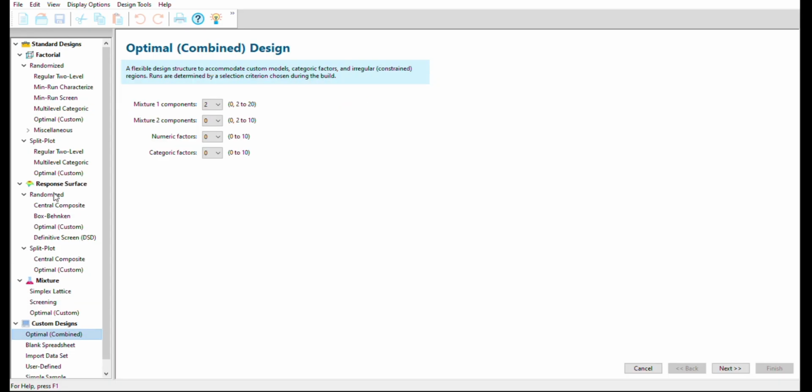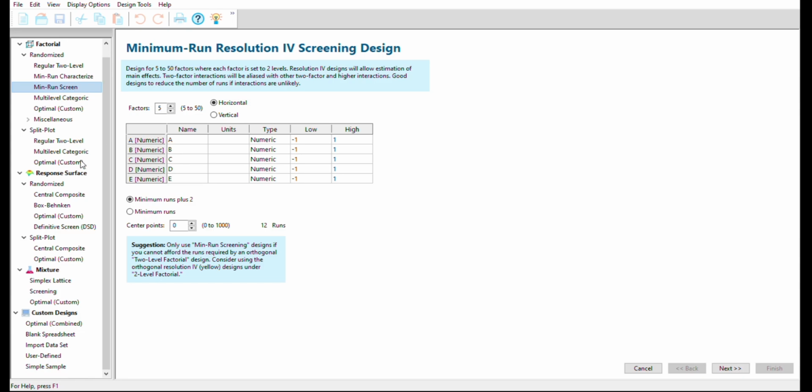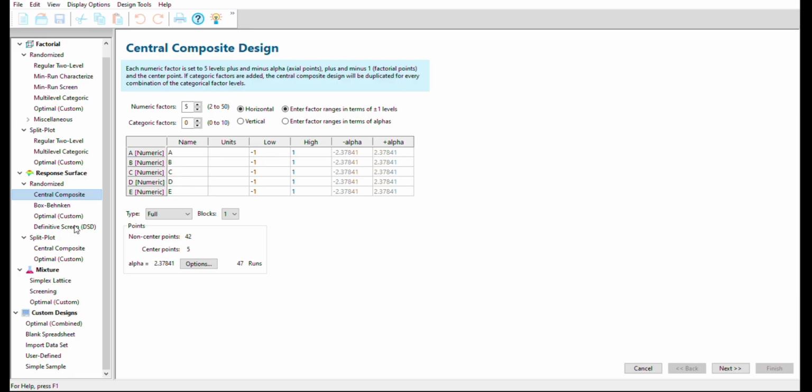Which design you will follow depends on your literature review and your type of formulation. For example, in most cases for nano formulations or some other formulations, you'll see in the literature that the Box-Behnken design is used. In some cases we use central composite design.